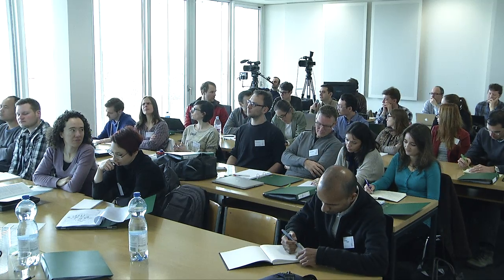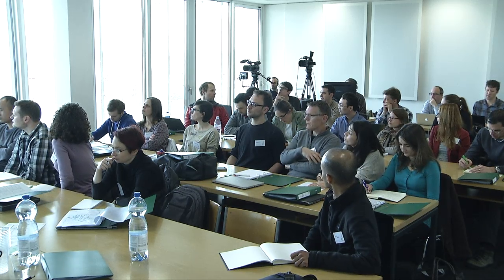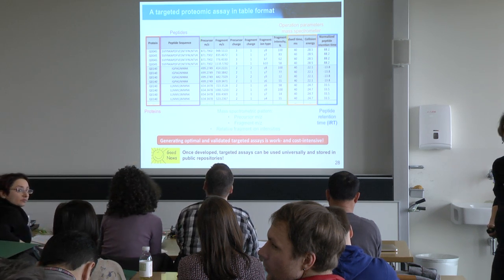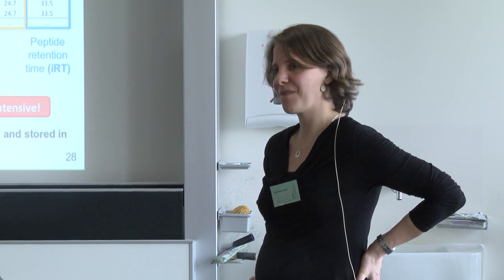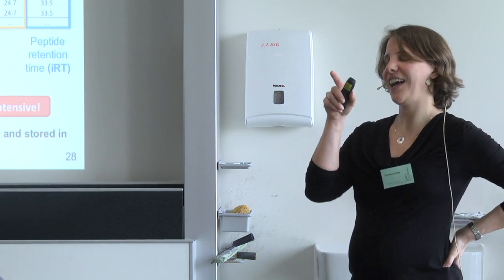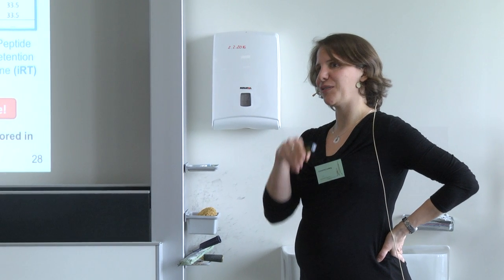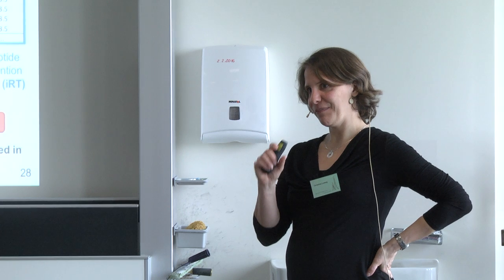So I just have a question concerning when I'm doing my discovery work in the beginning and I'm looking for transitions on Orbitrap. It's an HCD cell. And then I do my SRM on a regular CID cell. Am I going to see huge differences between the 2 instruments? Maybe I'll just refer to Ariel's talk later on, and HCD mode is already a good way to do your discovery. But you're completely right.